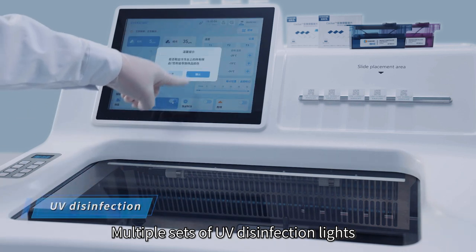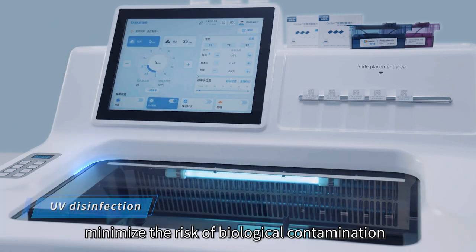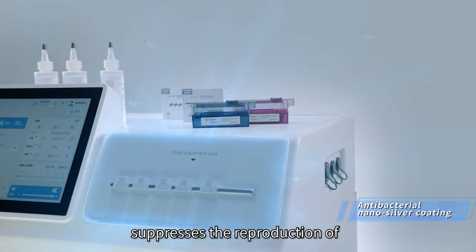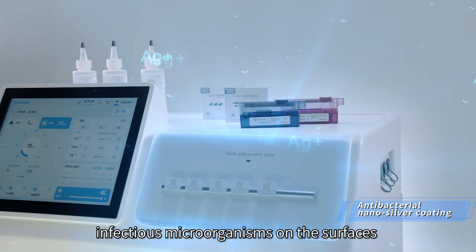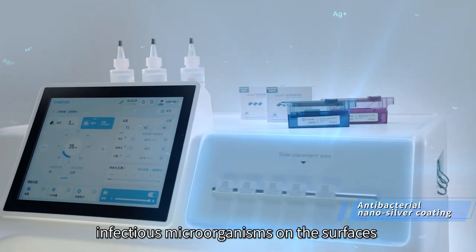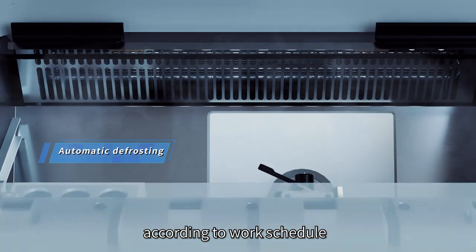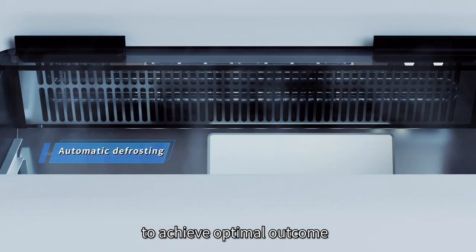Multiple sets of UV disinfection lights minimize the risk of biological contamination. Antibacterial nano-silver coating suppresses the reproduction of infectious microorganisms on the surface. Defrosting can be scheduled flexibly according to work schedule to achieve optimal outcome.